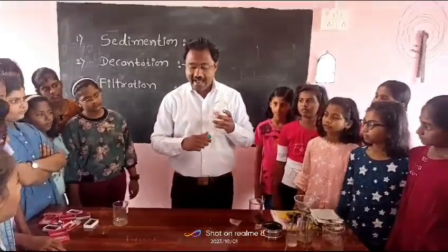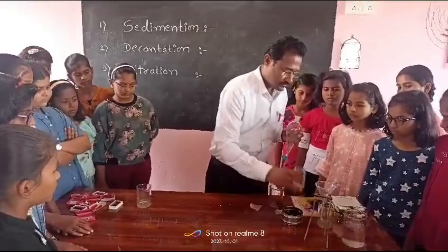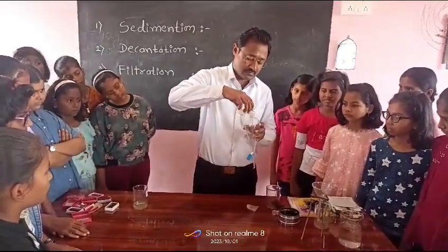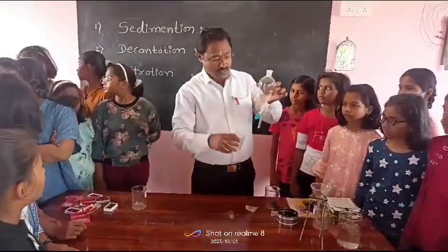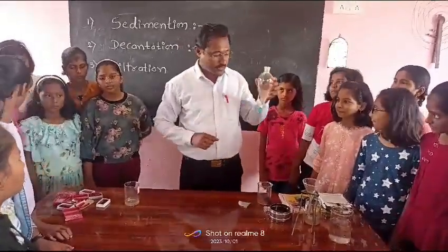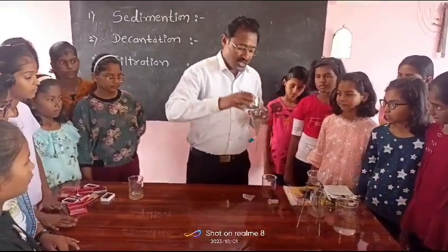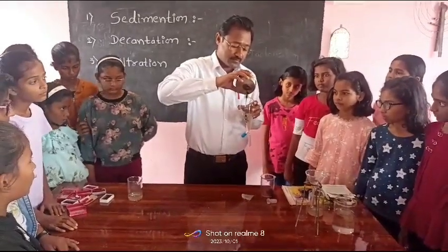In that funnel, I pour some water. In that water, now I pour some oil.